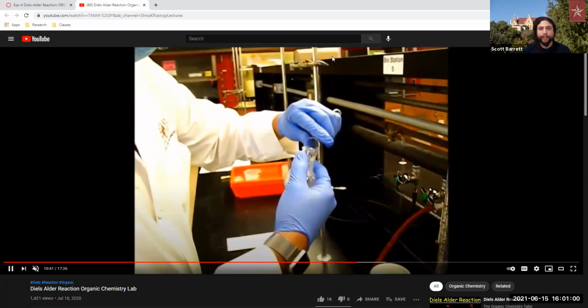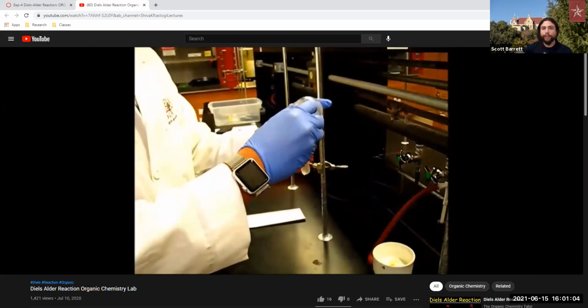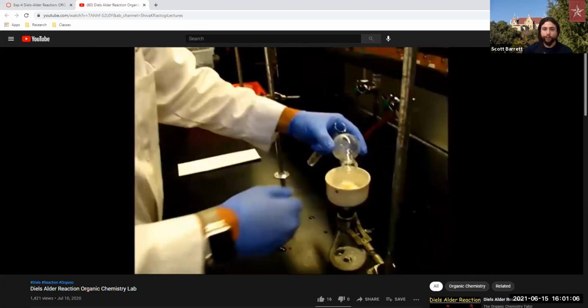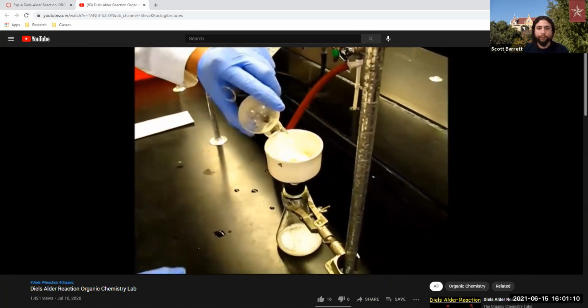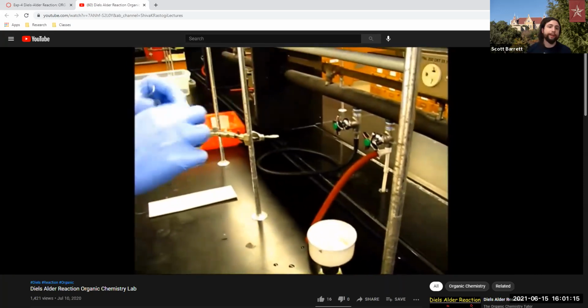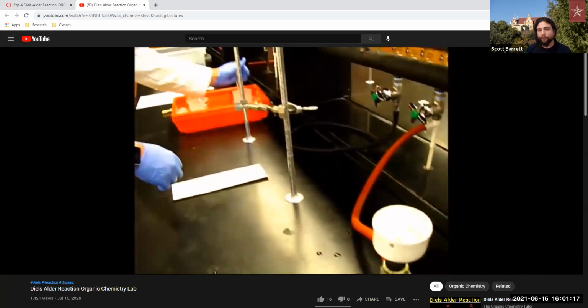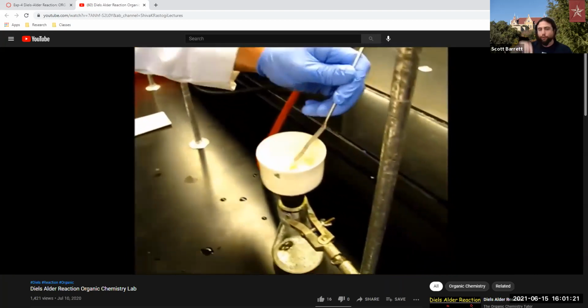It's ready. Now we pour the cold xylene over from our test tube into the round bottom flask, shake it around a little bit, and then we pull over the rest of the stuff that may be left in the round bottom and pour it over into there. And additionally, if you were in lab and needed to get a little bit more out, take more cold xylene, pour it into your round bottom, and then pour it back over into there.